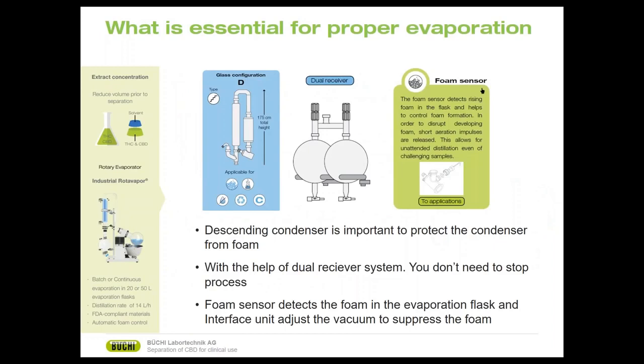If we take a look at what is essential for the industrial type of rotary evaporation, there are three main things that we must consider. First one, a descending type condenser. It is very important to protect the condenser from the foam. The condenser is where your ethanol condenses and distillation is done at this step.